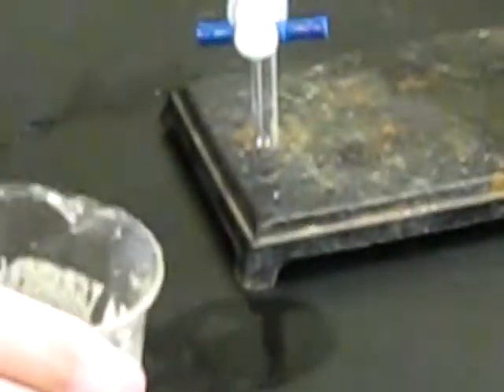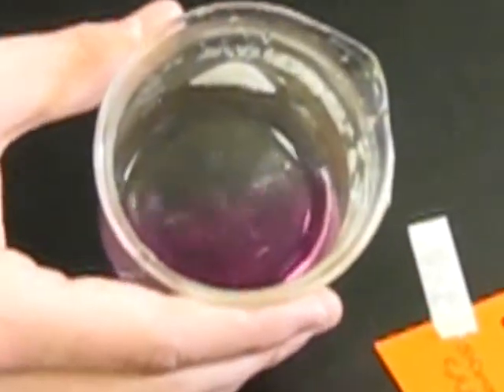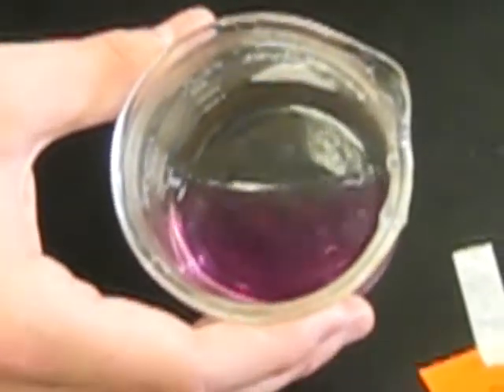This process can take a little while. You want to be careful that you don't add too much base, that way we get an accurate reading at the end. There's like a drop right there. Oh wow. Okay, so the color started to hang around. It looks like we got about the color that we needed right at the start there.